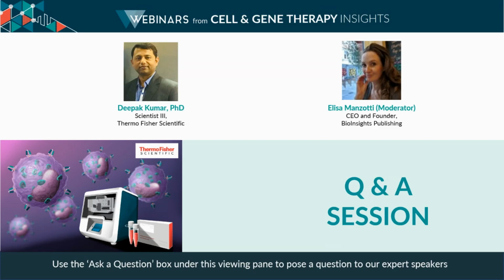Excellent. And then a few more questions that are coming from the audience. So why do you transfect after 6 days? Is there a difference in electroporation performance over the expansion period? Yeah, that's a great question. So we optimized this one. We tried to edit the NK cells on different days, and we found that day 6 is the best day for editing.